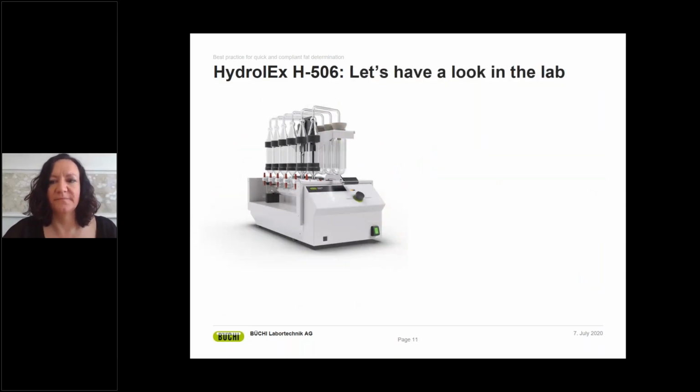Now I would like to show you the movie, how my colleague Maren Sander is actually hydrolyzing samples in the laboratory.